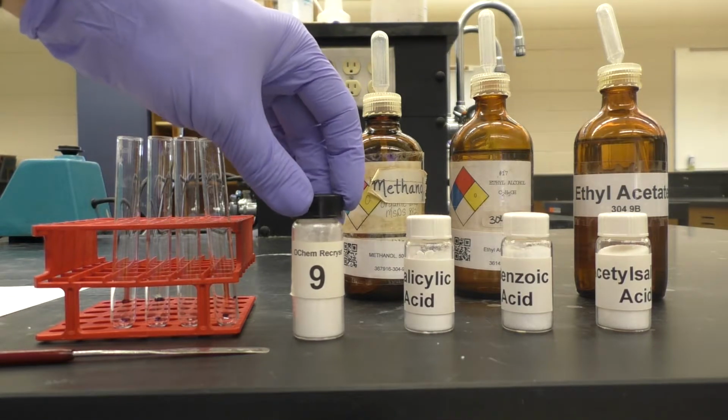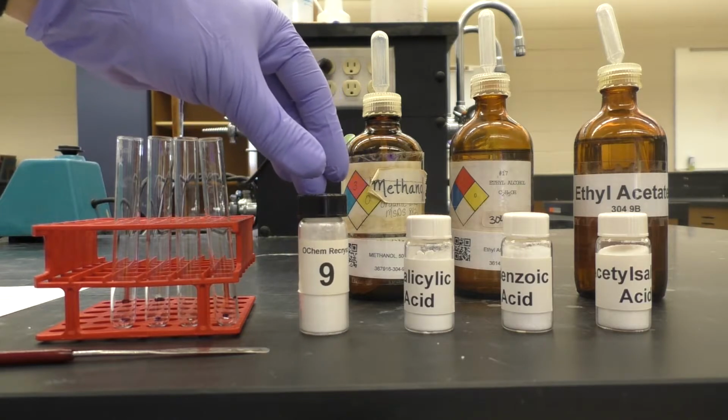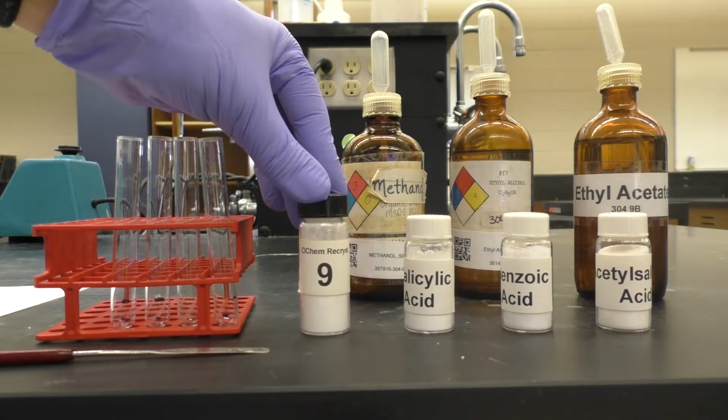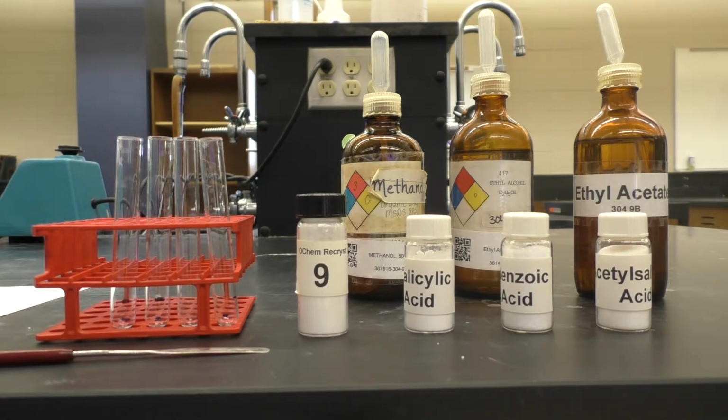But we also know that it's been contaminated with maybe about 10% of an impurity. Urea is technically the impurity here. And so we don't know which of these it is, and if I take the melting point of it, the melting point is going to be significantly depressed, so I won't be able to assign positively which of the known compounds it corresponds to. So I need to do the recrystallization to purify the compound, and then I will be able to tell by melting point or mixed melting point measurement which of the known compounds this unknown 9 corresponds to.